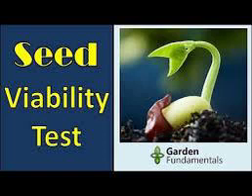It is impossible to determine whether a seed is live or dead from external physical appearances, like seed shape and color of seed. Hence, viability testing is used to determine the percentage of viable seed in a given lot. Seed viability is one of the indications of potential performance in the field. The germination test and Tetrazolium test are two important viability tests used by seed laboratories.